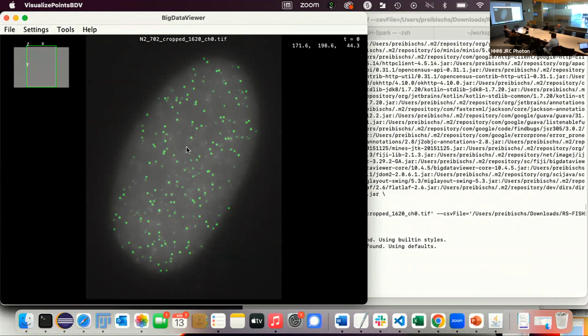So yeah. With that, I conclude my how-to session. If there's anything, if you want to use it or something, you can always ask us for help. But it should be rather self-explanatory as long as the images are not too big. Spark is always a bit of a, you need some experience there, because with every distribution technique, like also running it on the cloud.